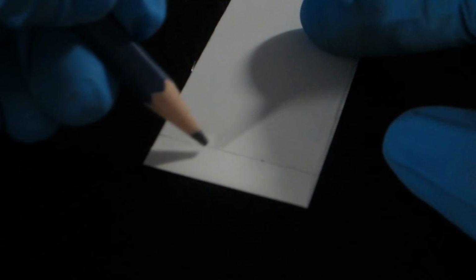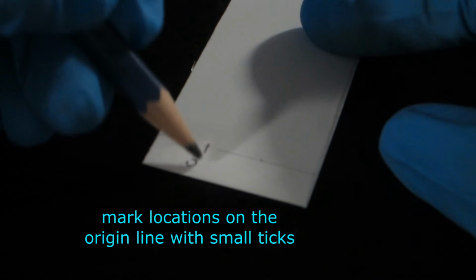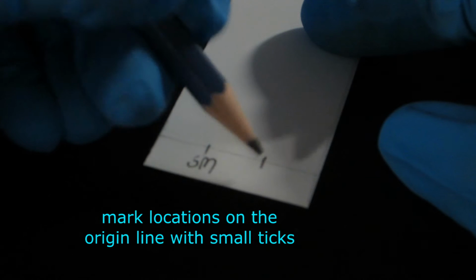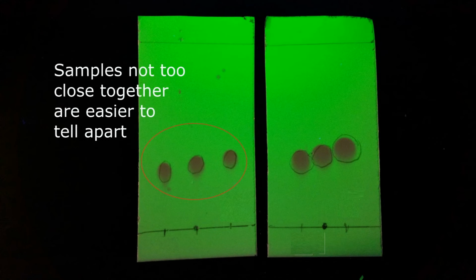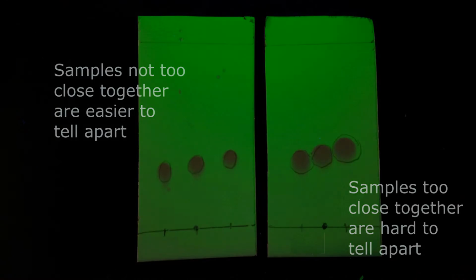In intervals of about half a centimeter, mark locations on the origin line with small ticks with an indicator below it identifying the specific sample that will be spotted there. For example, you may use the letter R to indicate a reaction mixture, SM for starting material, and P for product. Be sure to keep all spots at least half a centimeter from the edge, otherwise the samples may not move up the plate in a straight path. In addition, if the samples are too close together, they may bleed into each other and it will be difficult to tell the spots apart.